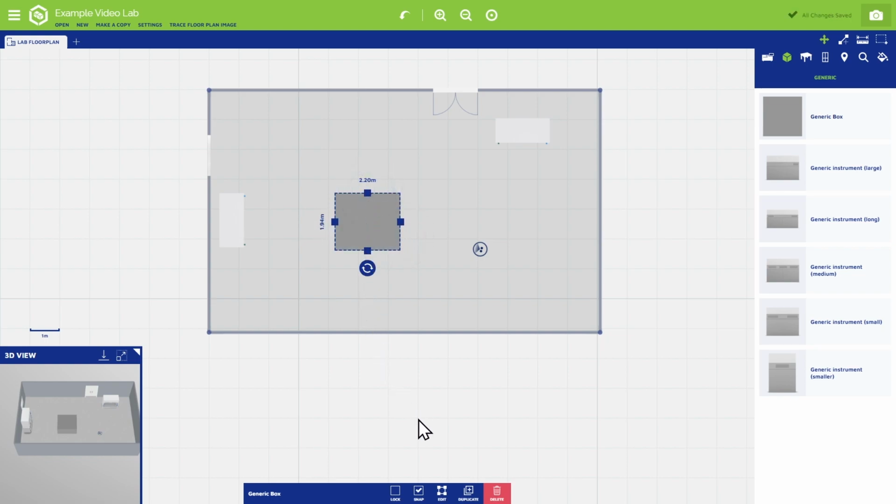or you can use the various functions of the Asset Control panel that appears whenever any asset is selected to edit it in all sorts of ways. You can give the generic asset a unique name by typing it in directly to the left side of the Asset Control panel. This name will appear on the generic asset in both 2D and 3D.